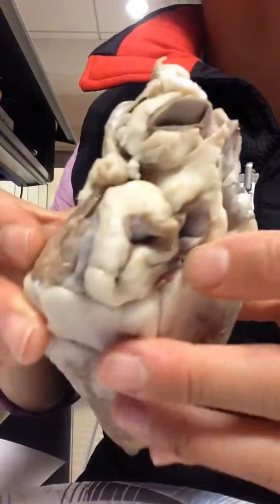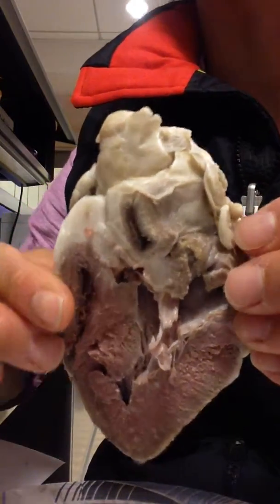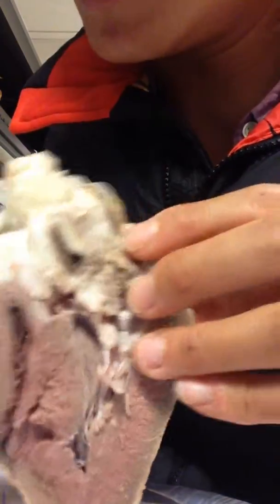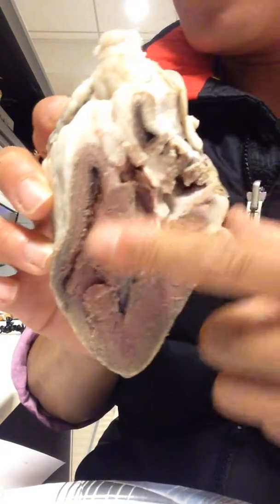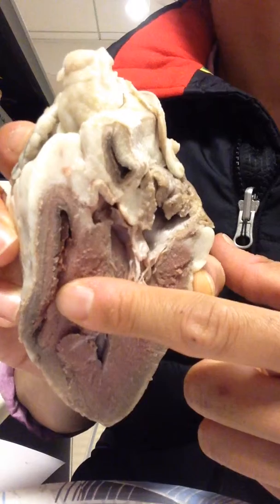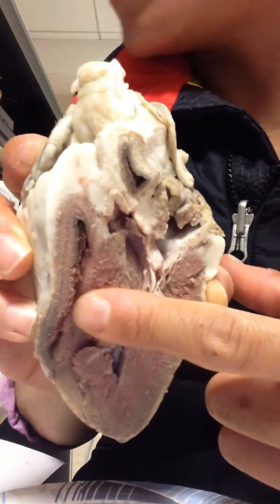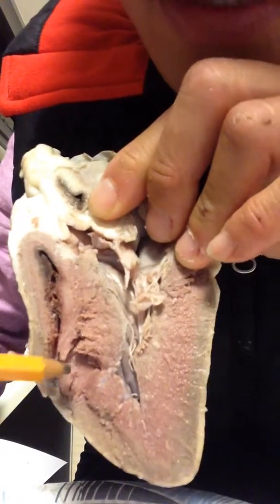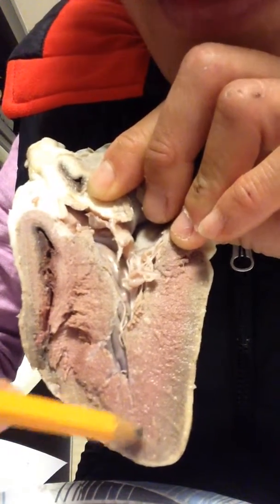Okay, so that's the external anatomy. So on the internal, let's see, show the pectinate muscles in the inner wall of the right atrium. So let's see, the pectinate muscle, it's here. Show the myocardium of the right and left ventricle. The myocardium is this here. It's right here. And here.